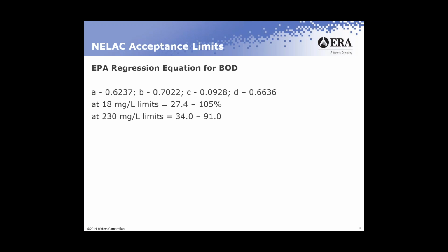Your A factor is a decimal representation of the expected recovery, which is 0.6237 or about 62%. So you're expected to get back 62%. That's what you'll be judged upon. If you get evaluated against 100%, just about everybody's going to fail, so it's not fair to you.